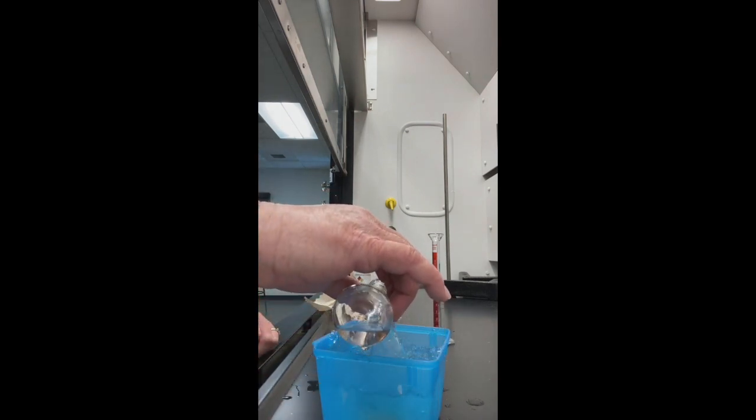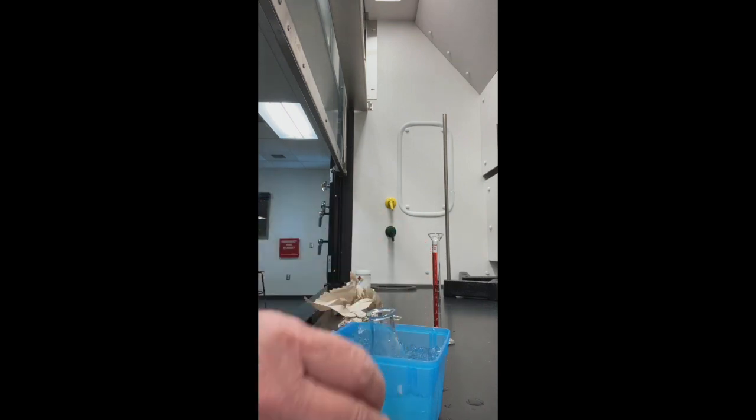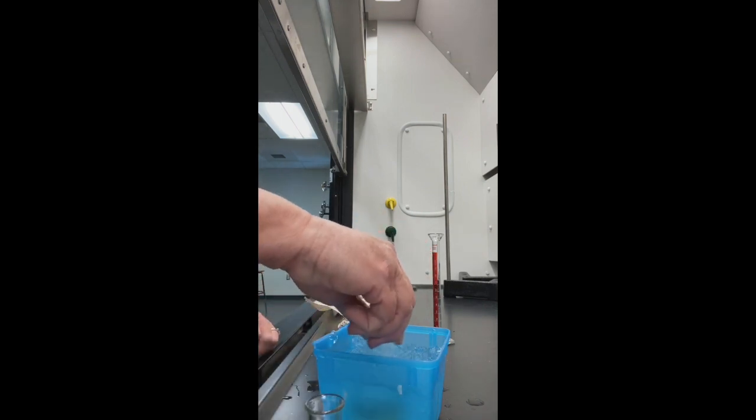I'm now adding my nitric acid and sulfuric acid dropwise. I'm keeping my flask inside the ice bath because it's heating up quite a bit. I'm going to add just a few drops at a time and swirl.